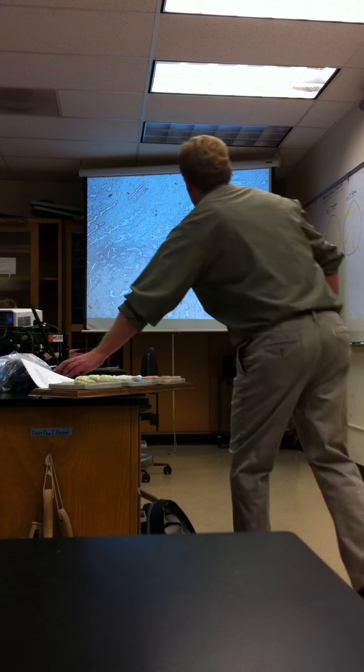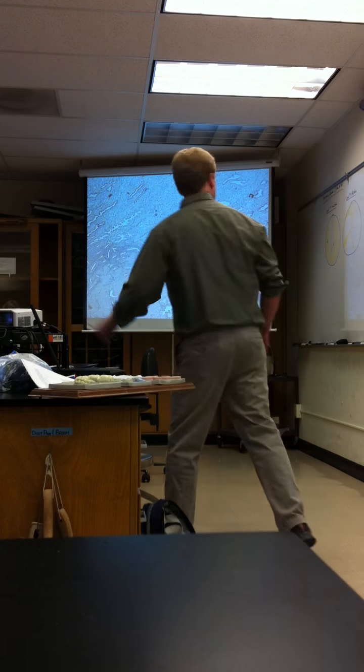And then finally we go up near the, now you can see the endometrium. And then we can see the lumen of the uterus up there. So the white space there is the lumen of the uterus. And so that light purple is the endometrium. So I'm going to put it right there where we can see the myometrium and the endometrium. And so the slide would look something like this.